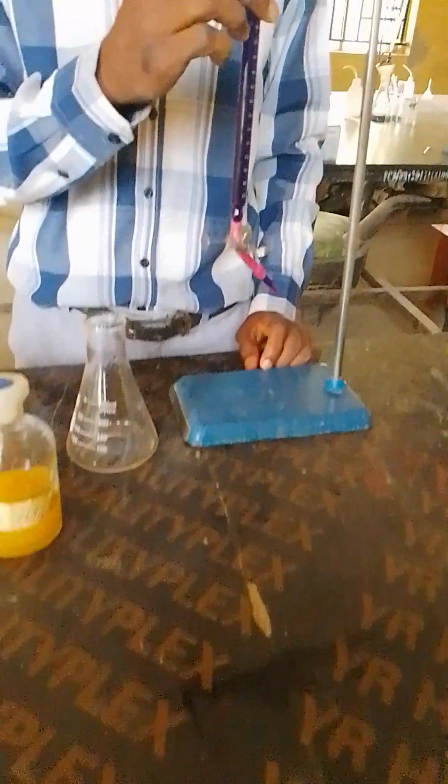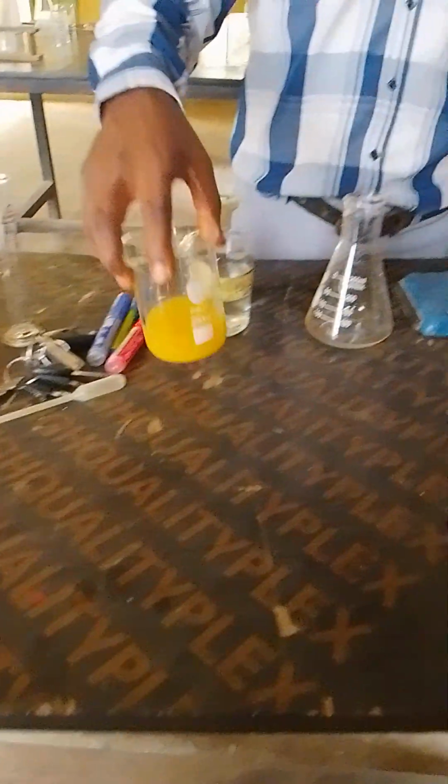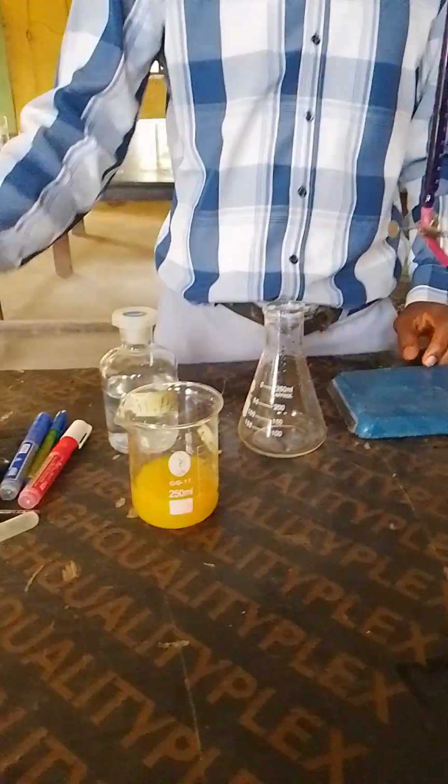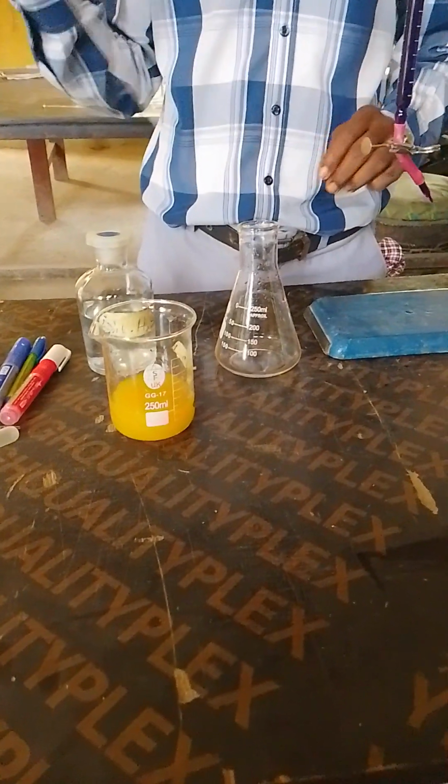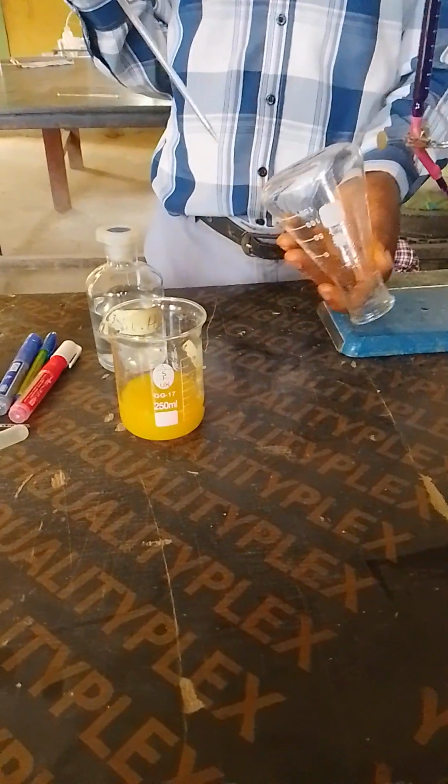I have prepared my KMnO4 into the burette. Then I have gotten my iron sulfate. And what we are going to do, we are going to prepare the iron sulfate. In your school, you may be having 20 cm cube or 25. Mine is 25 cm cube. So if I could prepare this now, I'll pour it into the flask.